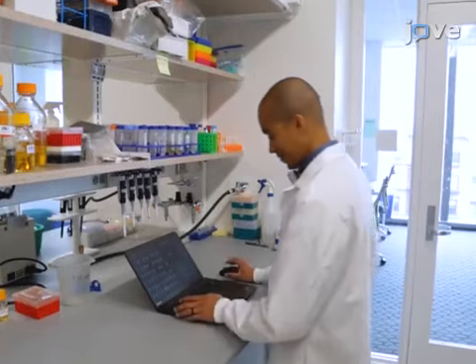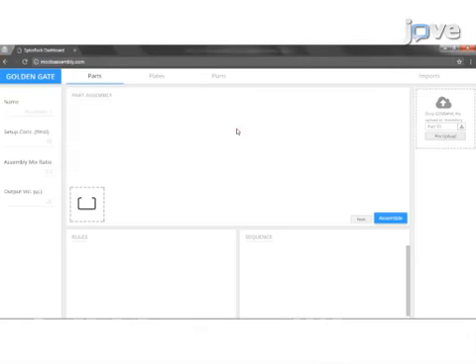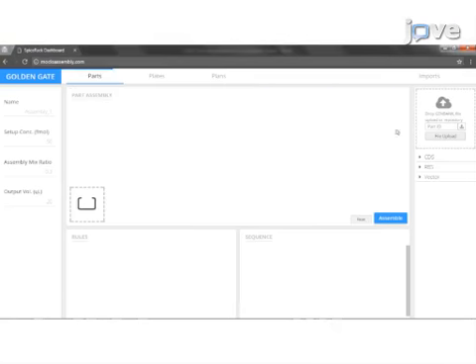A software tool that can automate script generation was developed for this study. Using any web browser, navigate to mocloassembly.com and upload GenBank files for all DNA parts that will be included in the combinatorial DNA device design.